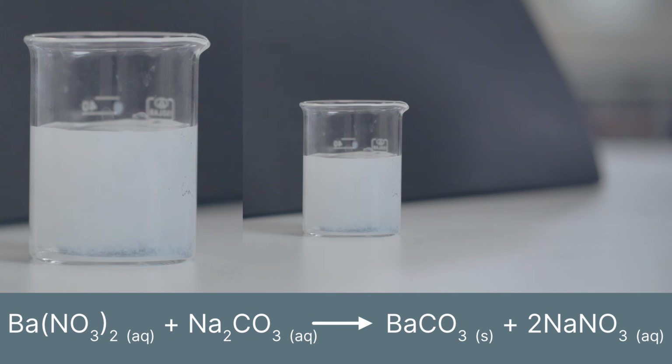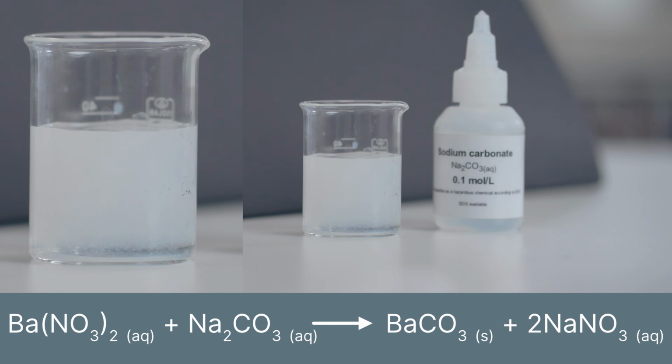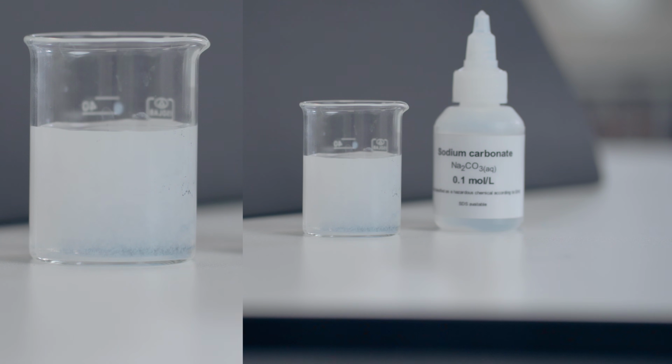There we go. So this is more the standard type of precipitation you'll find. A lot of chemicals will combine to form white precipitates. To get the really interesting colors, you would have to find solutions involving some more of the transition metals. So that's going to be things like iron, copper, zinc, and so forth. That region of the periodic table is typically responsible for a lot of the beautiful colors, like in paint.